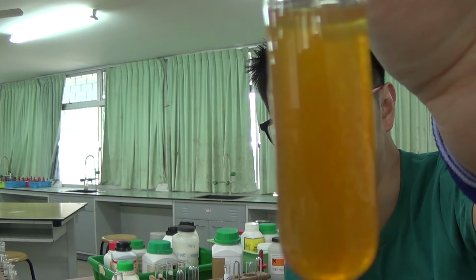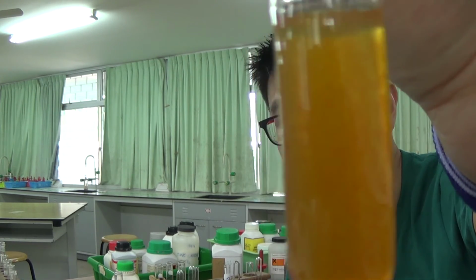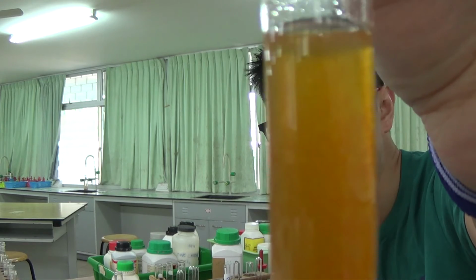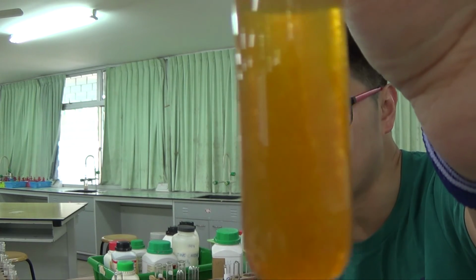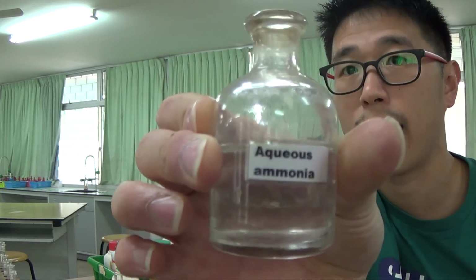That means it's a precipitate. You do not say it dissolved because you cannot see through it. Like just now, the aluminium hydroxide was a white precipitate. In excess sodium hydroxide, you could see through it because it went colorless, right? Just like this, it does not go clear. Yes, it's colored, so it doesn't go colorless, but you do not see through it in excess ammonia.